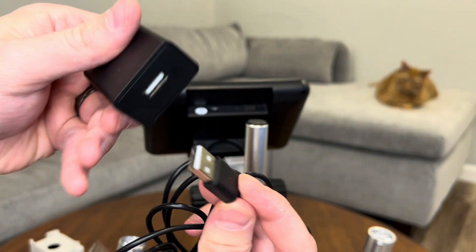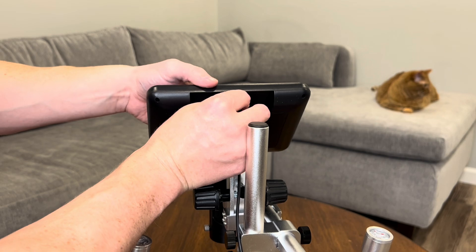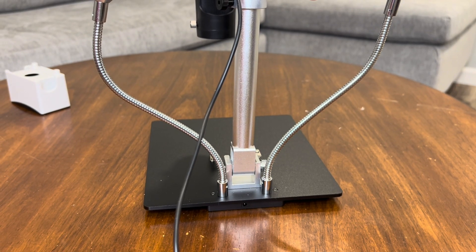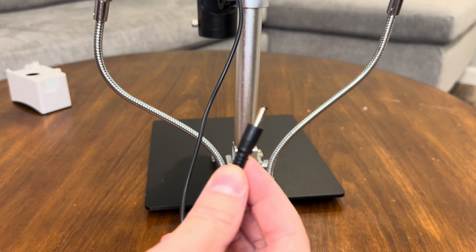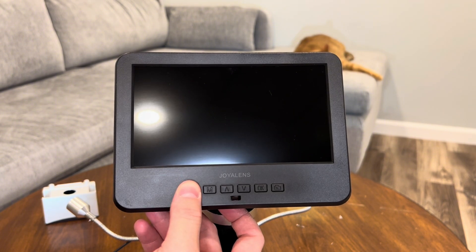Next, I'm attaching the USB power cable to the power brick. The power cord then plugs into the back of the microscope, and it also plugs into the base to control the LED lights. Once it's plugged in, you'll just hold down the power button to turn it on.